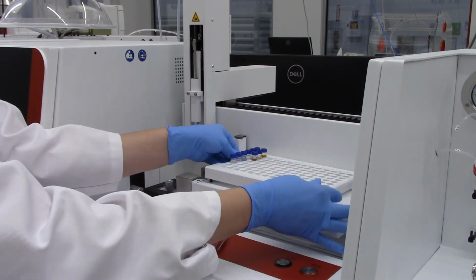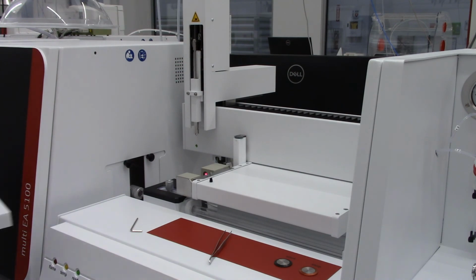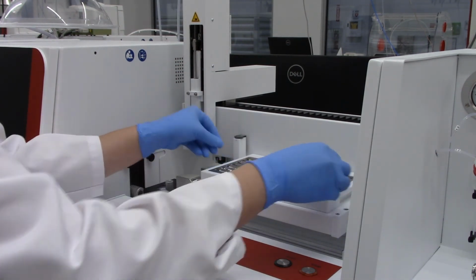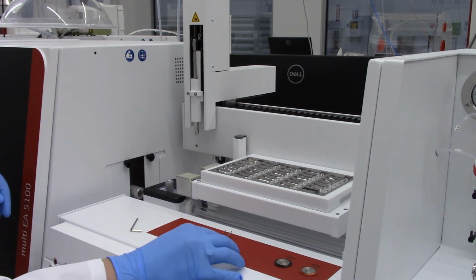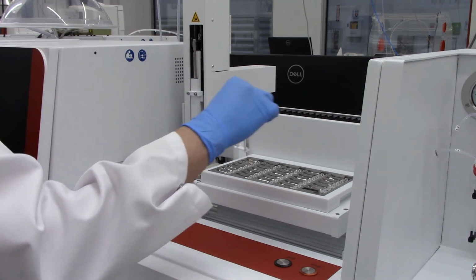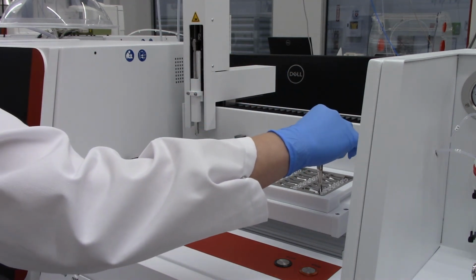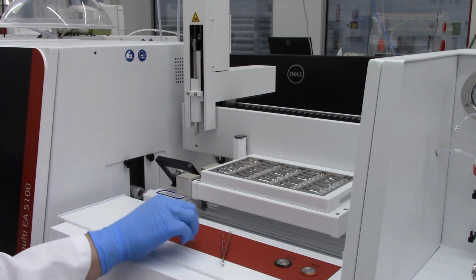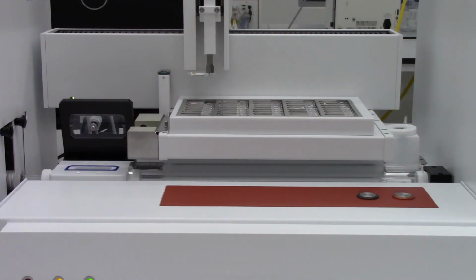The last thing we have to do is put the solid sample tray on the autosampler and remove the quartz boat that we used for liquids analysis before. The software automatically recognizes the changes we've made and ensures that the instrument configuration matches the method parameters. And now we can start running the first sample.